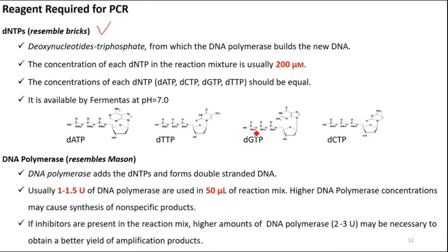Yes, so it is the dNTPs and the DNA polymerase.